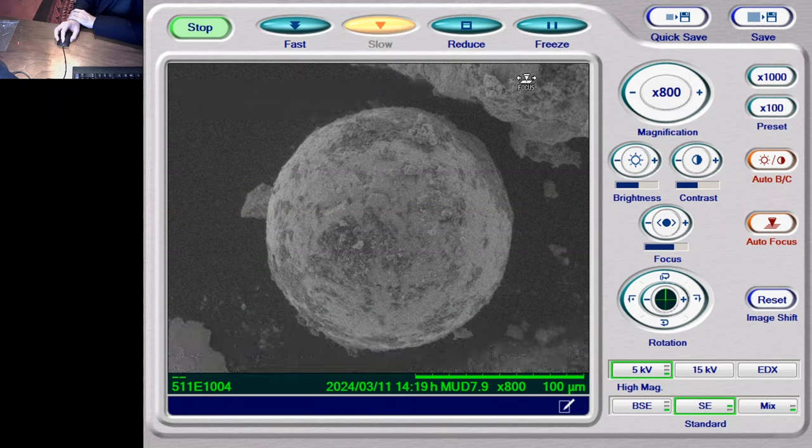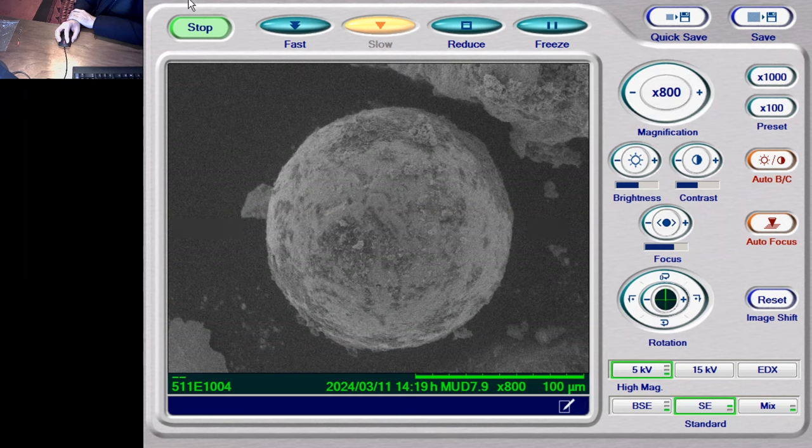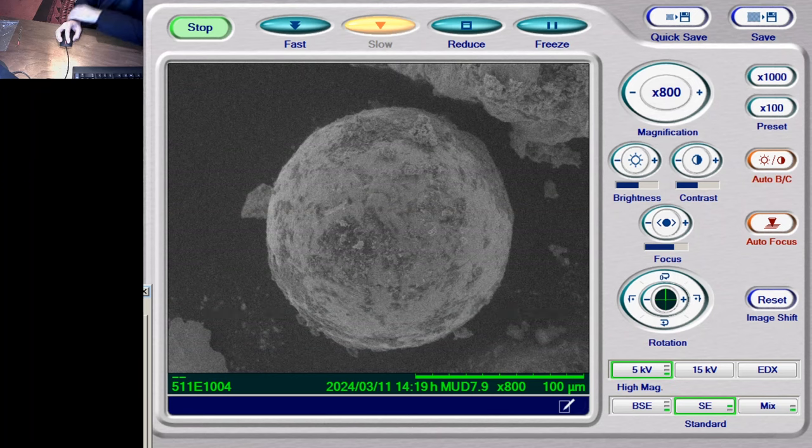Is that a sphere that's been rounded off? Don't know. I think we should find out what it is in terms of elements. I think that would be a good idea. So I think we'll take an image here. See what the settings are. Settings for save. Save image. Need to change the names on this.